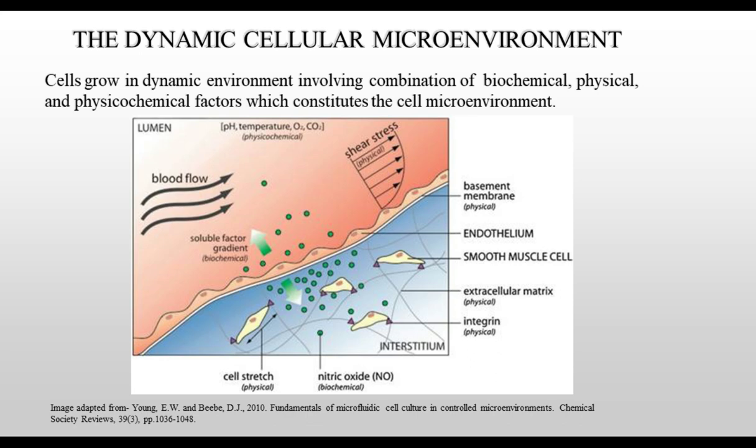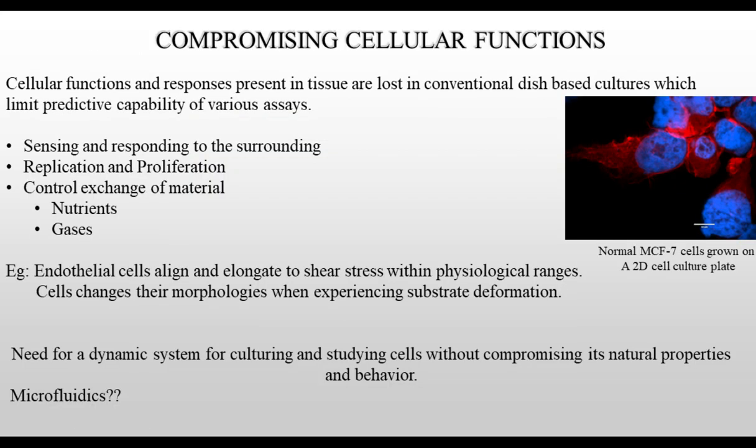And yet, in such a dynamic system, cells are able to replicate and perform their designated function. But in traditional dish-based or conventional assays, these functions such as sensing, replication, and exchange of materials might be altered as cells do not experience a dynamic environment.